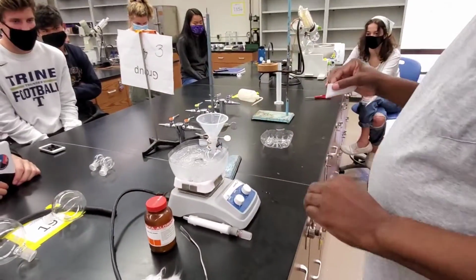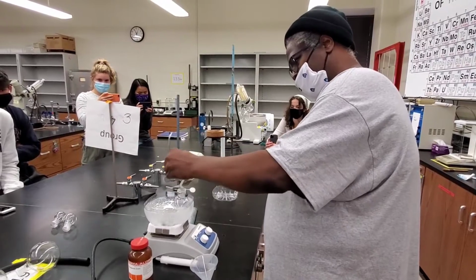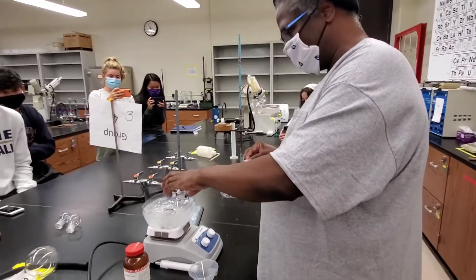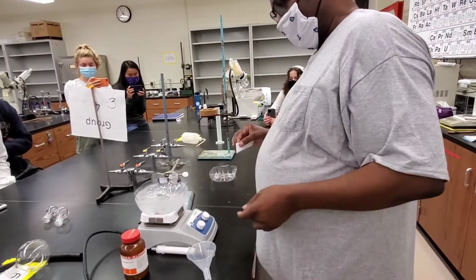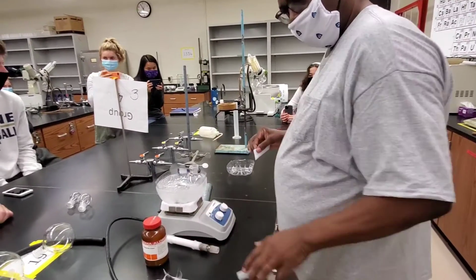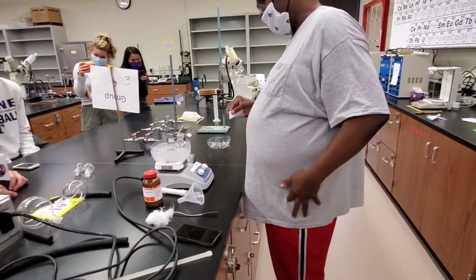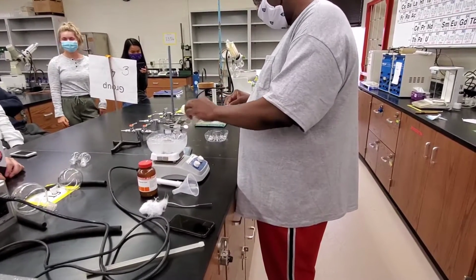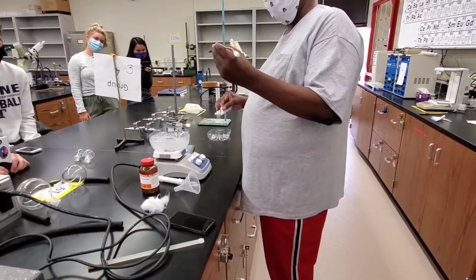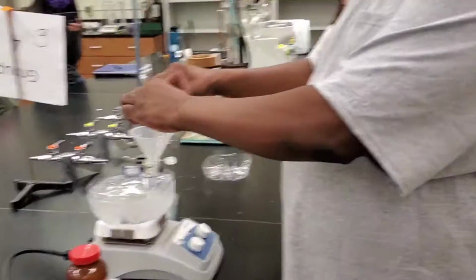Part of the reason is you try to avoid the reagents coming on the side of the mouth here, because if it gets stuck there, then you have less reagent to react, number one. Number two, when it stays here, it could start clogging up. For example, this wouldn't fit as neat and nice. When we are doing a reflux, and I'll show you with a condenser here pretty soon, that could really mess up the condenser as well. So if you happen to spill, especially solid stuff, on the inside of the mouth of the round bottom, you try with a glass rod, a spatula, or something to get it down. But first of all, try not to have it there. So you could use it this way.